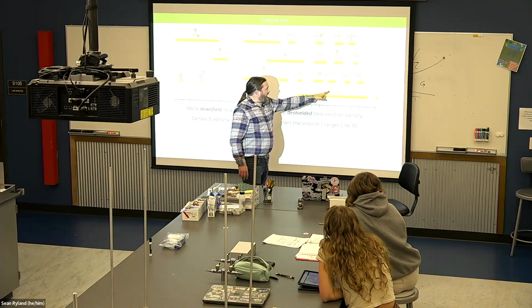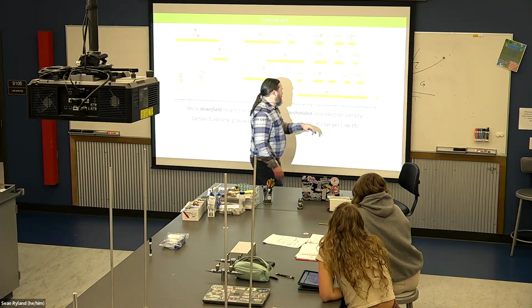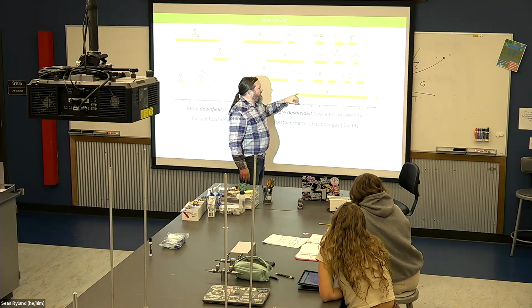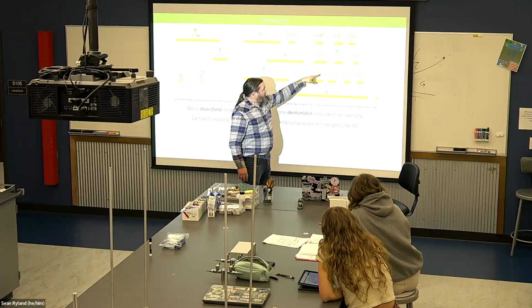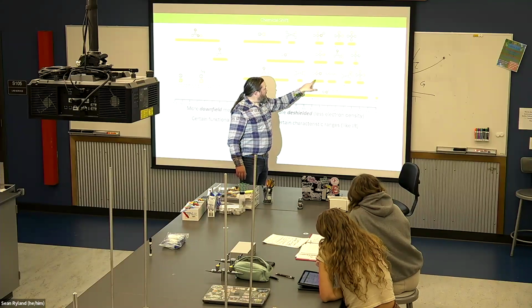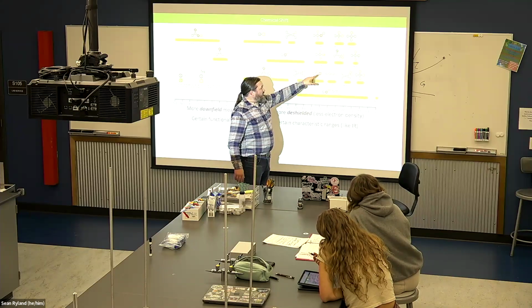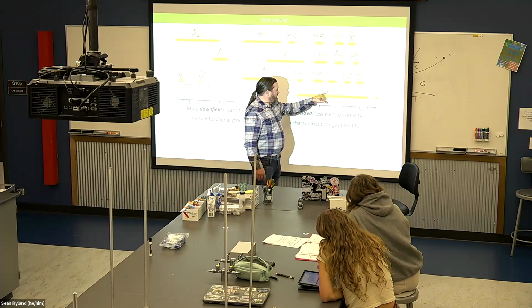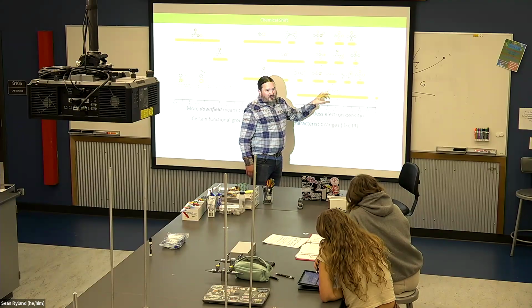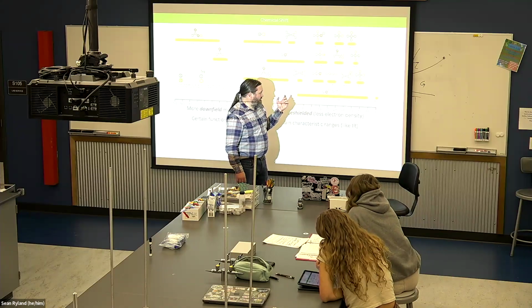Like the hydrogen attached to an oxygen has a really wide range, anywhere from 0.5 down to 5. But then again, the hydrogens attached to the carbon that has an OH attached to it show up in a very narrow area. And they will show up as two different signals. Alcohols are kind of weird in that because it's an oxygen attached to a hydrogen, sometimes they actually don't show up at all, and they don't have the same peak splitting.